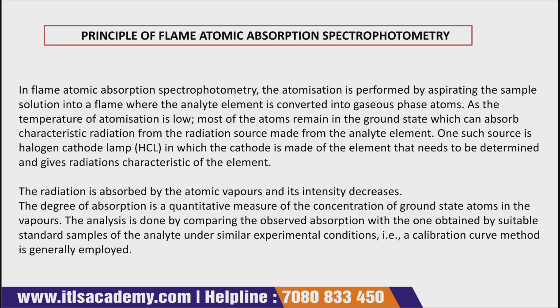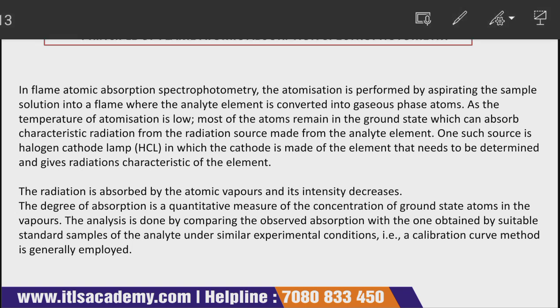In flame atomic absorption spectrophotometry, atomization is performed by aspirating the sample solution into the flame, where the analyte atom is converted to a gaseous phase atom.